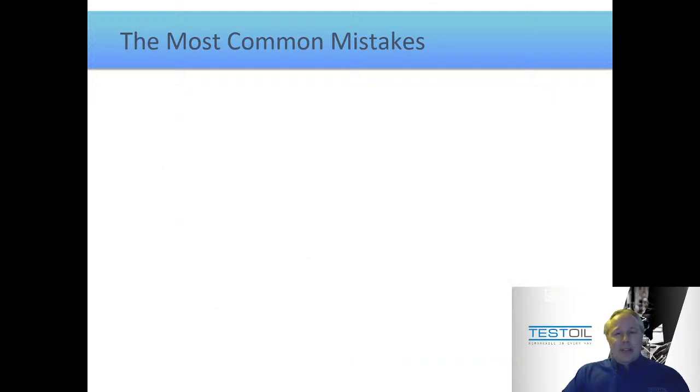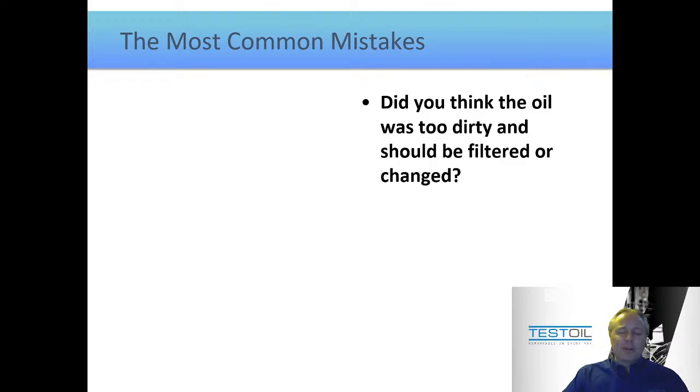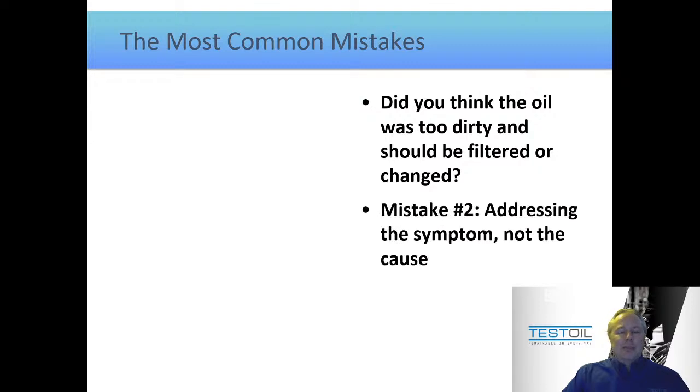Second common mistake, though, when you're looking at the report, did you think perhaps that the oil could potentially be filtered to remove a lot of these contaminants and thereby make the system better? And that's mistake number 2. Mistake number 2 is addressing a symptom rather than addressing a cause. Right? It's not to say we don't address symptoms, but if that's the only thing you're going to do, the problem will simply return again.